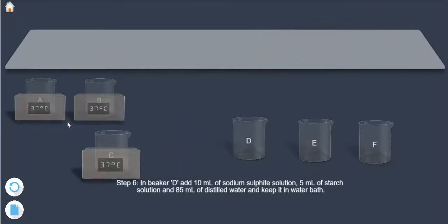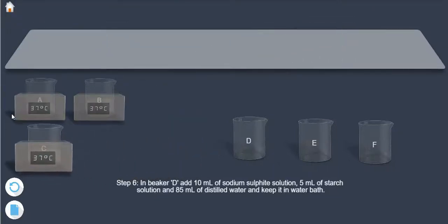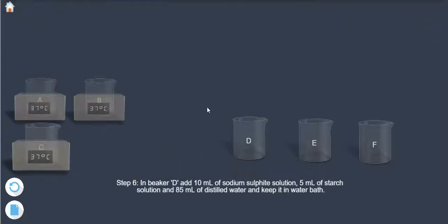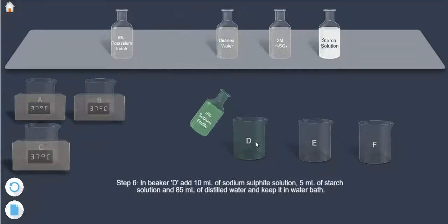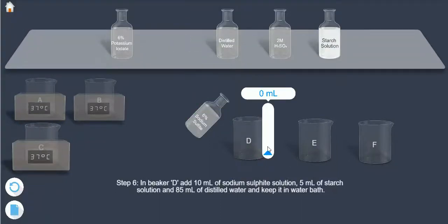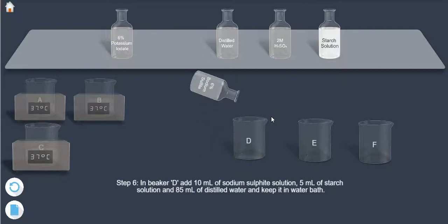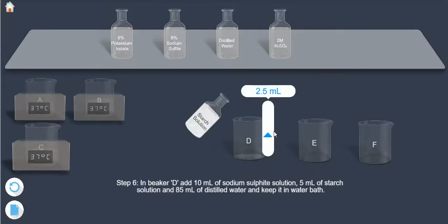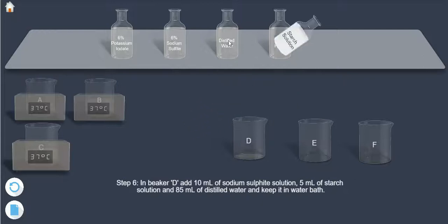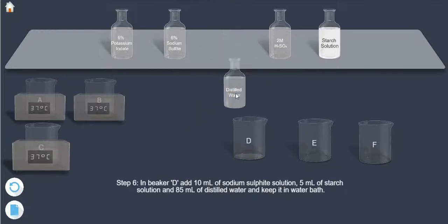Step 6: In beaker D, add 10 ml of sodium sulfite solution, 5 ml of starch solution, and 85 ml of distilled water, and keep it in the water bath.